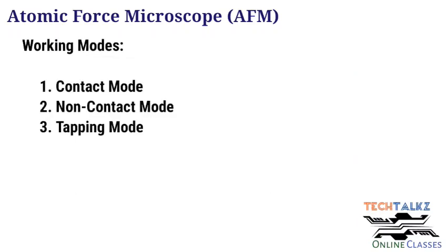Now we can see the working modes. Mainly there are three working modes. First one is contact mode, second one is non-contact mode, and the third one is tapping mode.